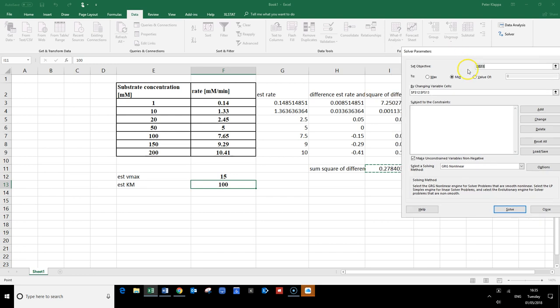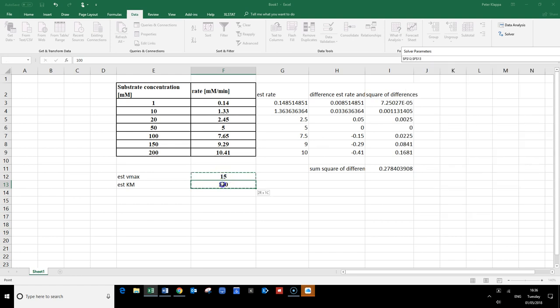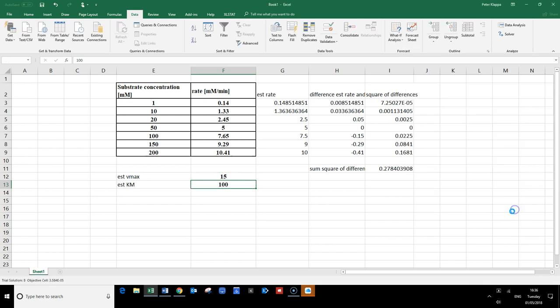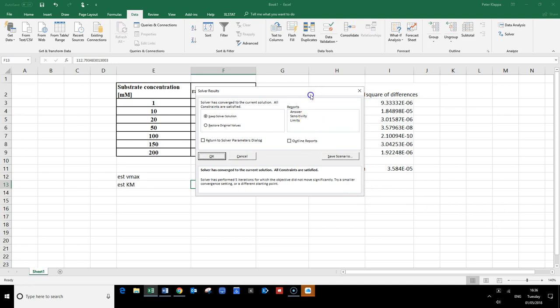In Solver, we set the objective: we want the cell containing the sum of squared differences set to a minimum. The cells to be changed are our estimated Vmax and Km. We set the objective cell to minimum, specify the changing cells, and we don't need to worry about constraints. Then we invoke Solver and wait for it to find a solution.